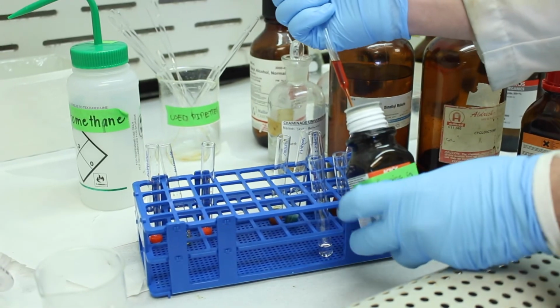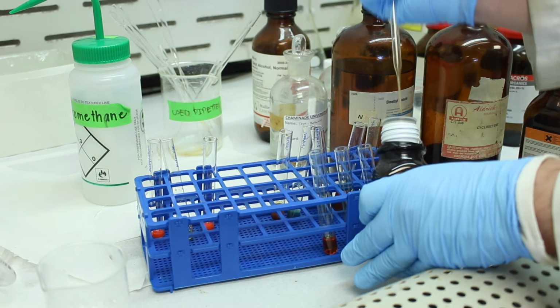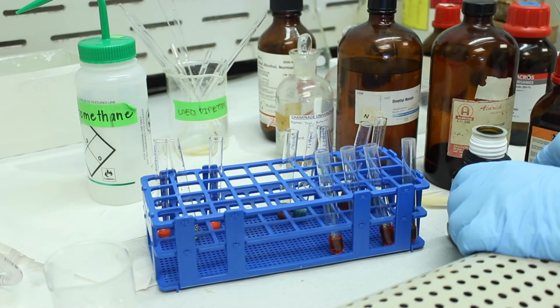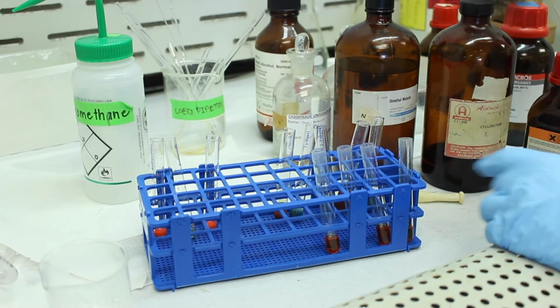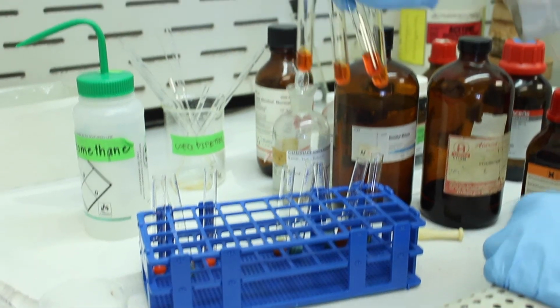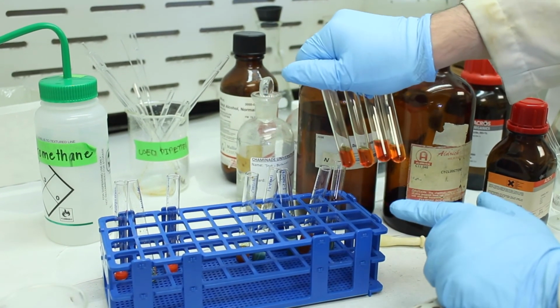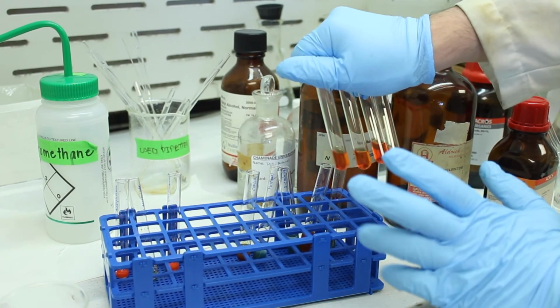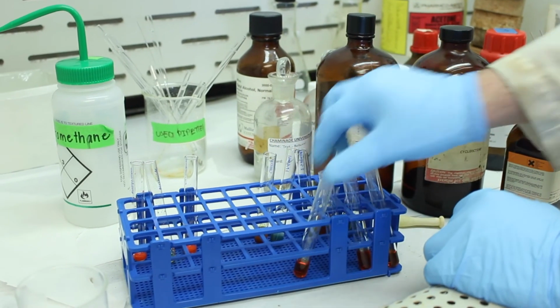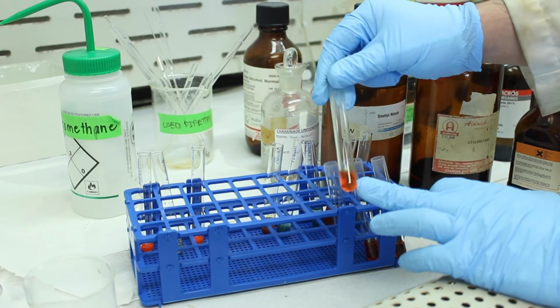So what we'll do is we'll add some bromine to each of these. A little bit in there, a little bit in there. Nice. So here are our samples made up. You'll see that's a nice red color. A positive test result is indicated if this red color disappears and/or there's a formation of a precipitate. The precipitates tend to be solids, white solids. So we have our control. This one we'll leave alone. We're not going to do anything to it. It's just going to be DCM and bromine.